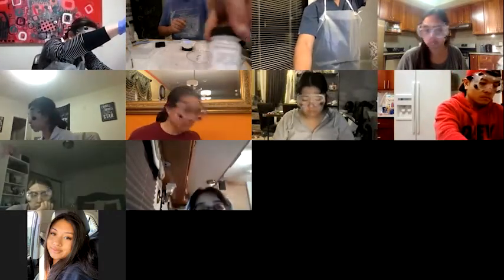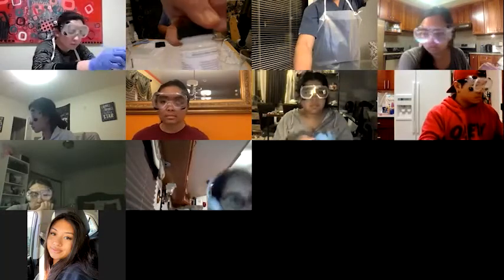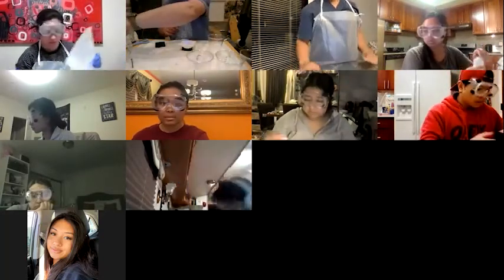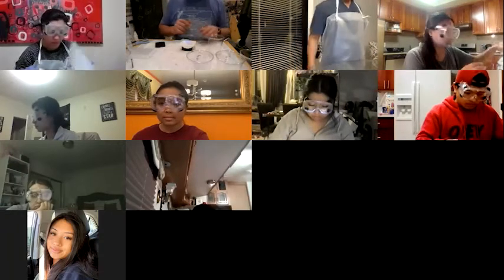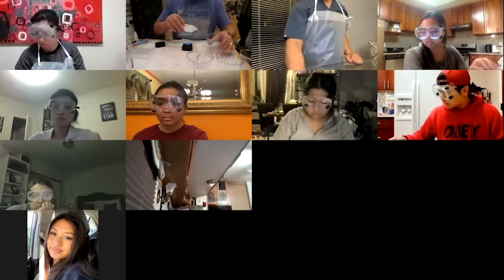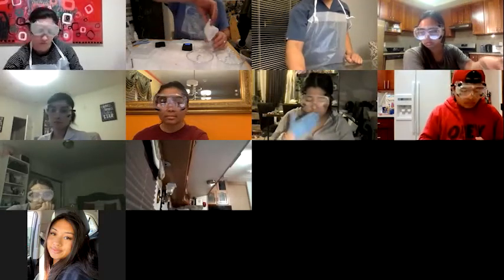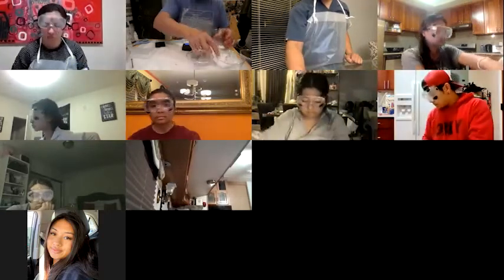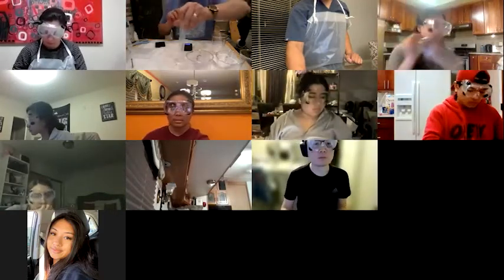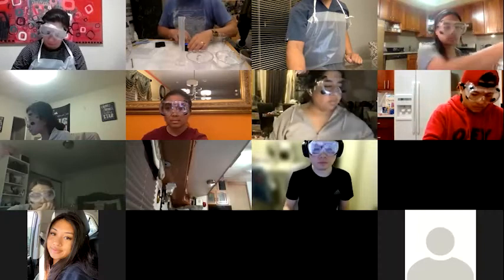So notice this says anhydrous on it. Can anyone tell me what that means? If something's anhydrous, then what is it? It doesn't have any water.